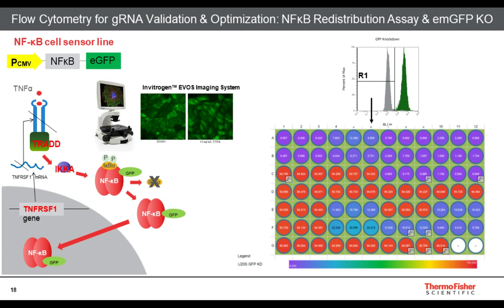In some cases, you may not need to go through sequencing. You may not need to end up with a clonal population. But let's say you're just trying to optimize your experimental parameters and see how well it works. So here's an example with fluorescent proteins. I just have the example here on the left because flow cytometry can definitely work very much hand in hand with cell imaging.